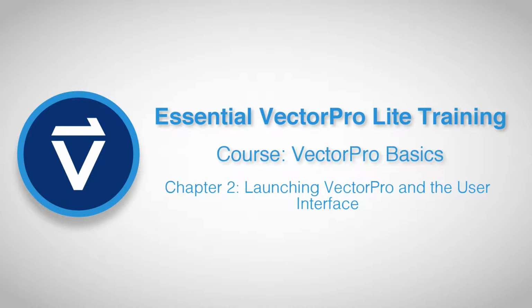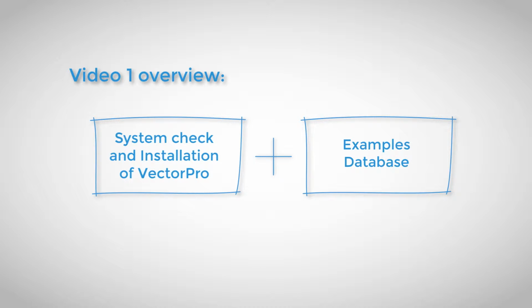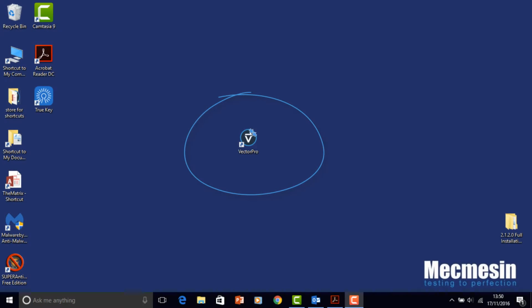Welcome to your Mecmesin VectorPro training video course. This is the first of many videos available that will lead you through the exciting new platform for force and torque testing. To get to this stage, you will have installed VectorPro along with the examples database already, and the VectorPro icon will be available on your desktop.